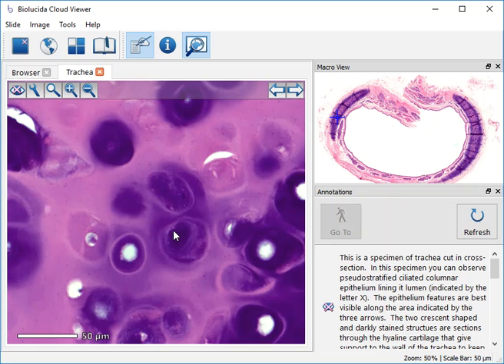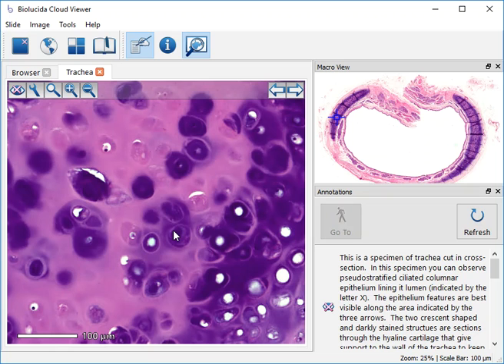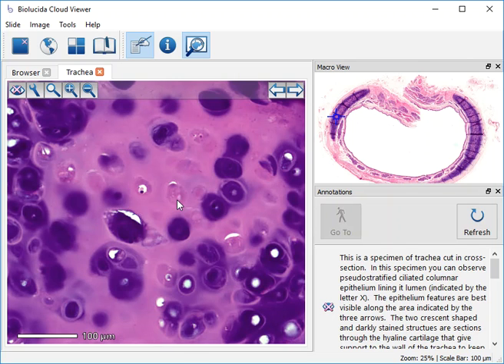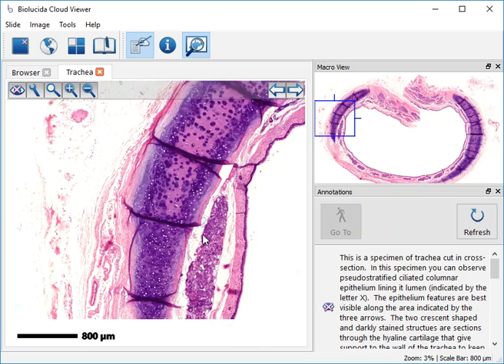And of course now you've already learned in the lecture on tissue preparation, staining, basophilia, acidophilia. So these are very basophilic areas of the cartilage, which means that it has an affinity for basic charges in the dye. So it's attracting hematoxylin, whereas these pink areas are attracting eosin to stain them.